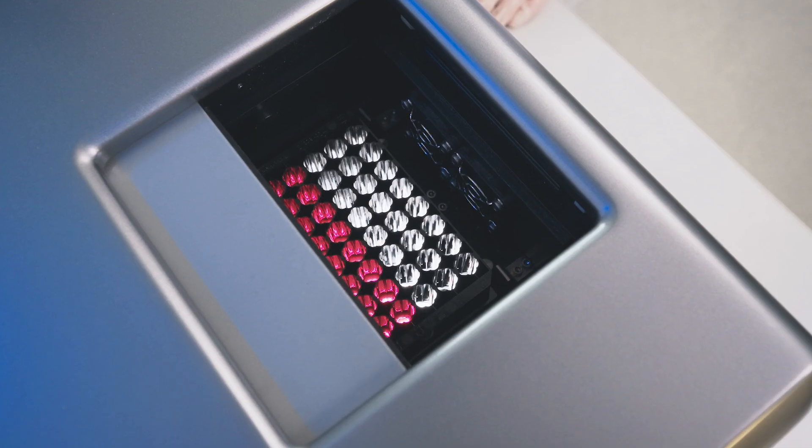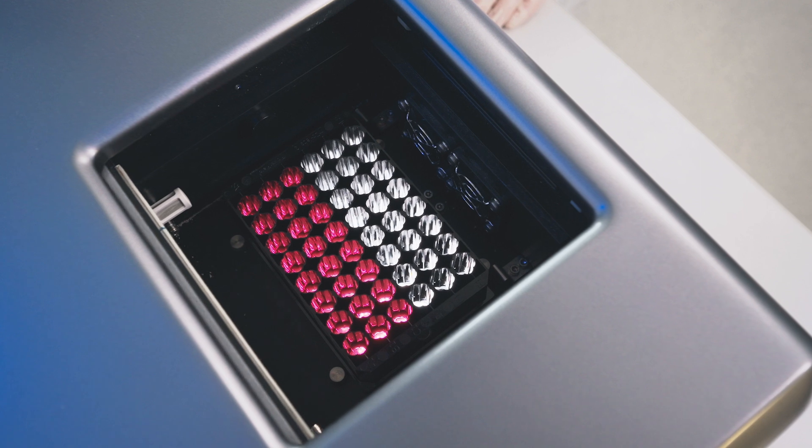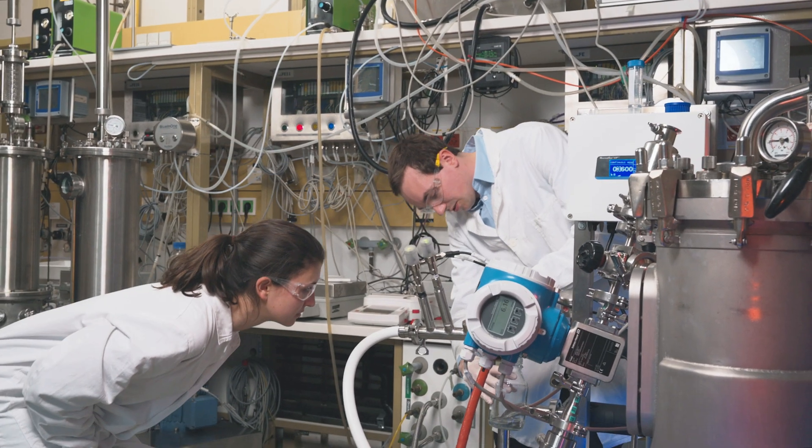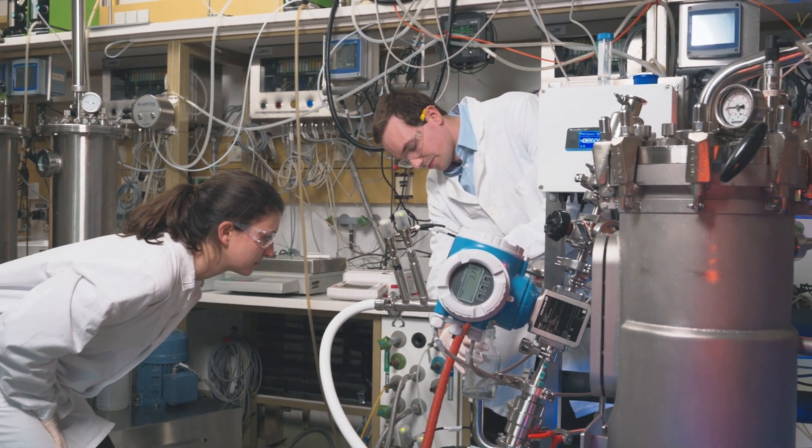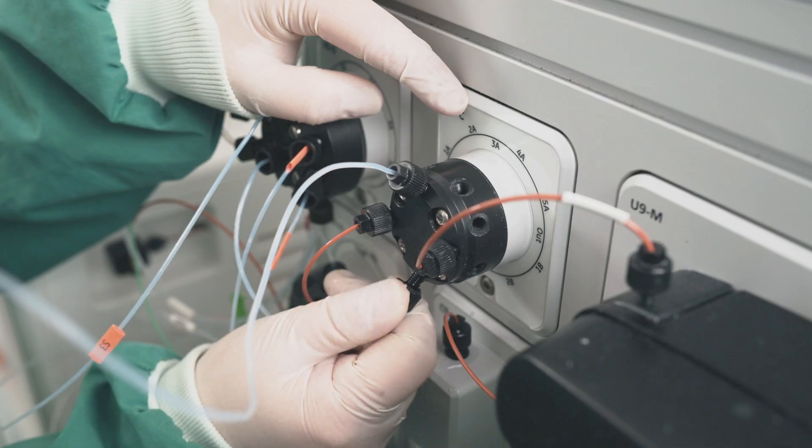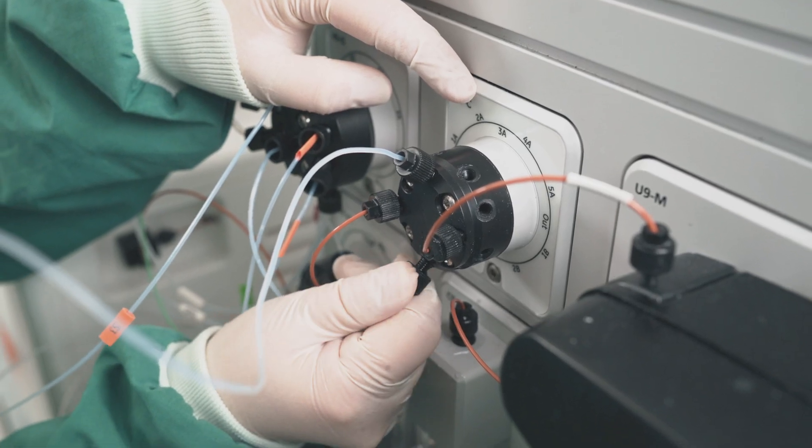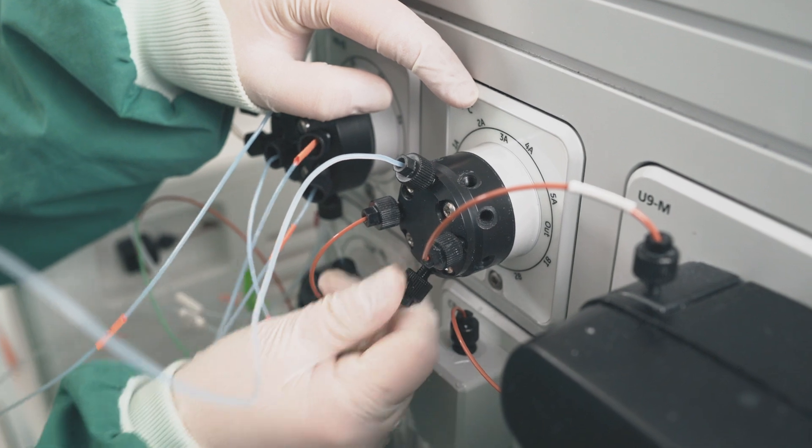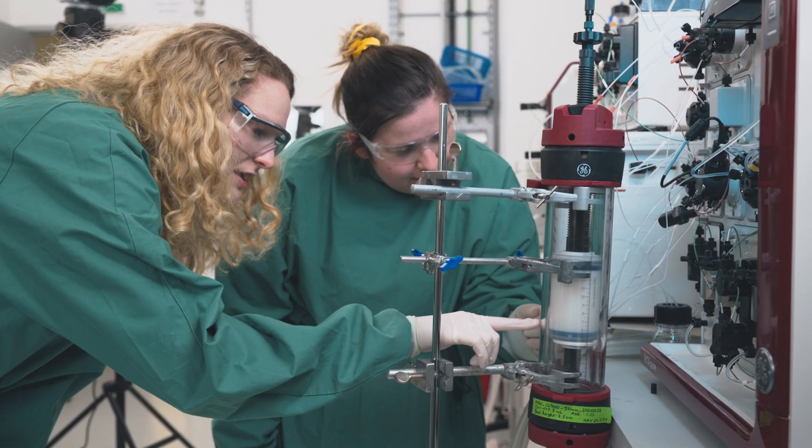We proceed with detailed optimization of automated, tightly controlled lab-scale bioreactor systems. All systems are coupled to a broad set of analytical methodologies, enabling us to characterize cells, products, and processes over time.